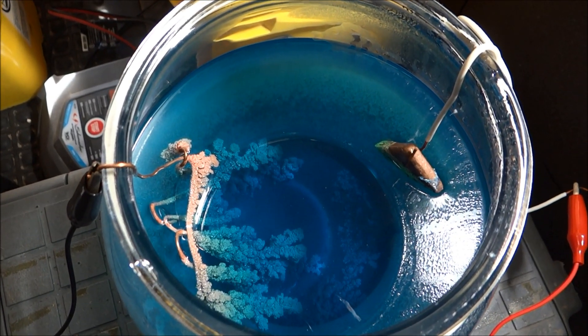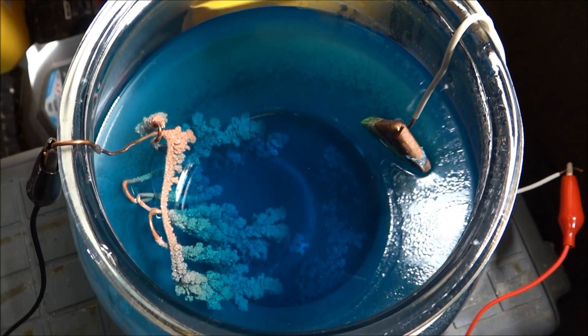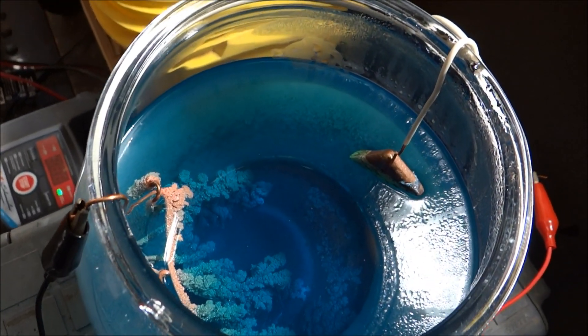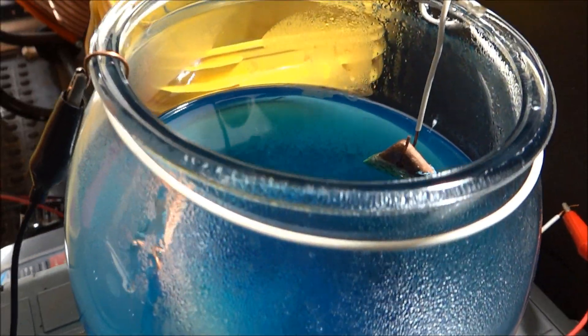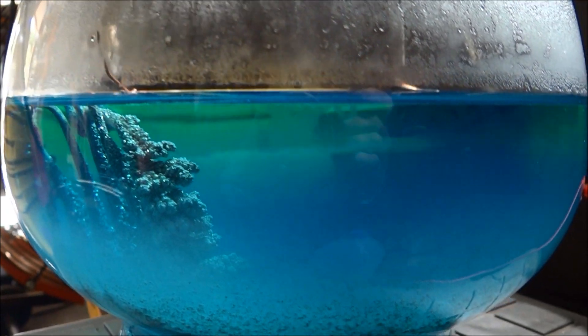Alright, so that's been running for I want to say five or six days maybe, and as you can see the anode is almost all gone. Since I've been running it so fast with 12 volts of electricity, I think that's all going to be really, really brittle. However, let's find out.